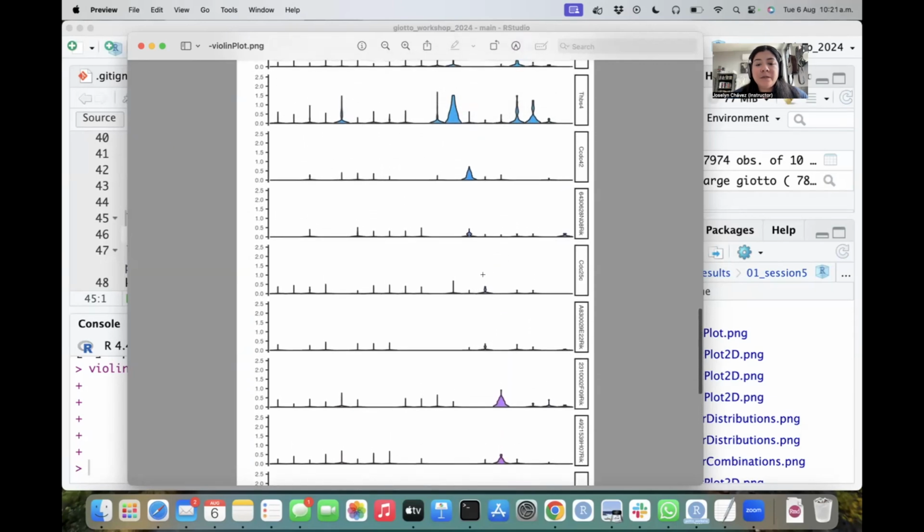Right? There are some of them that probably don't have the same level, since right now we are using the same scale in the y-axis. It's probably possible that some of these genes are kind of masked due to the scale.